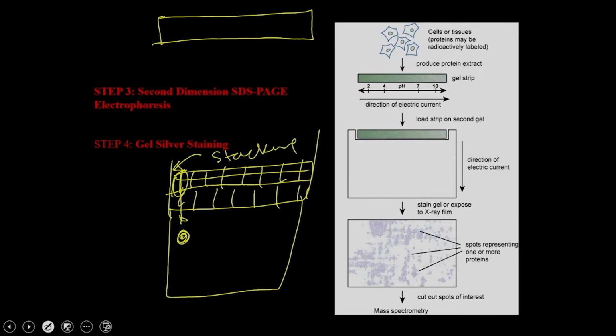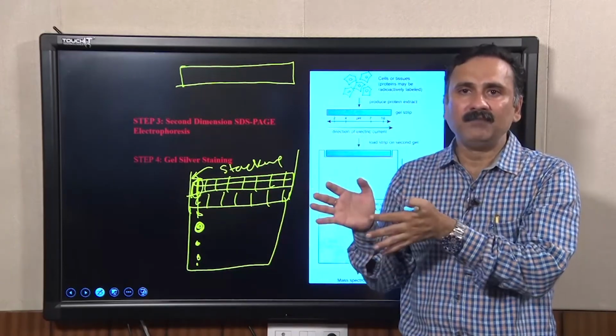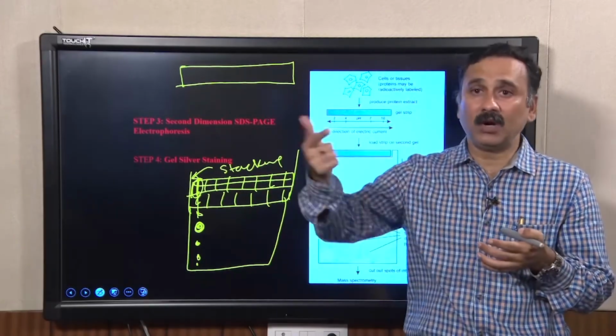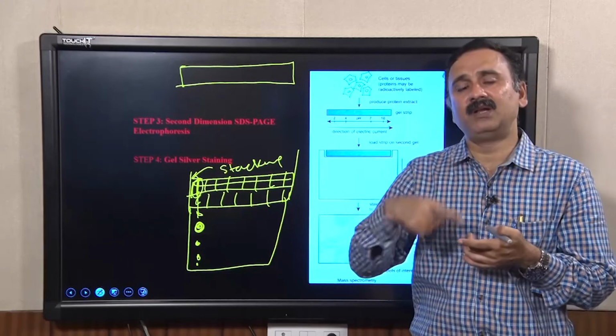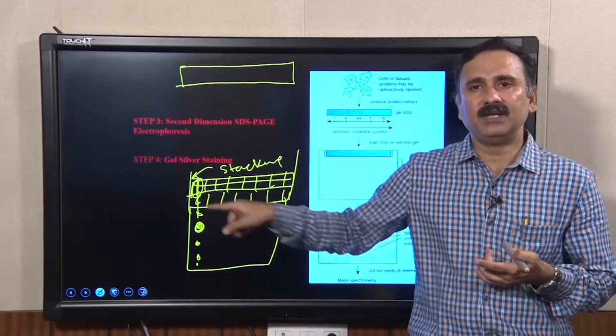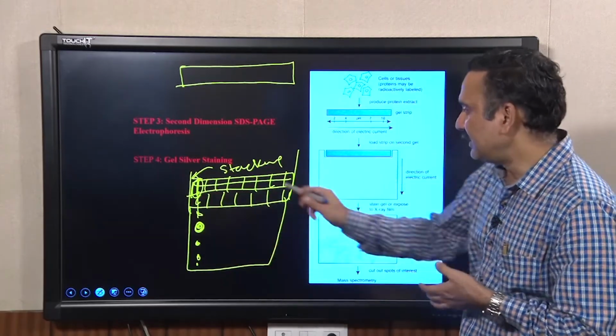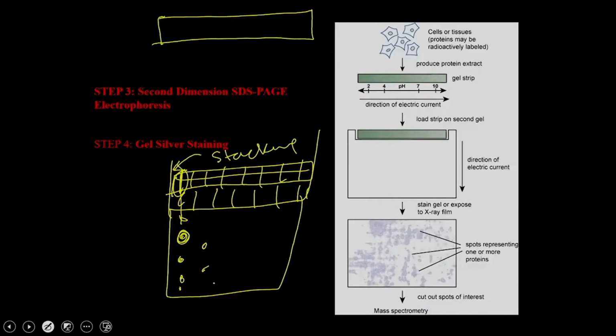You might have multiple proteins present in this particular spot, and that is why you see multiple spots from a single IPG strip focusing area, which means at a pI of 3.1 you might have 5 proteins, and all these 5 proteins may have different molecular weights, and that is why you see the protein spots at different positions, and the same will be true for multiple places.